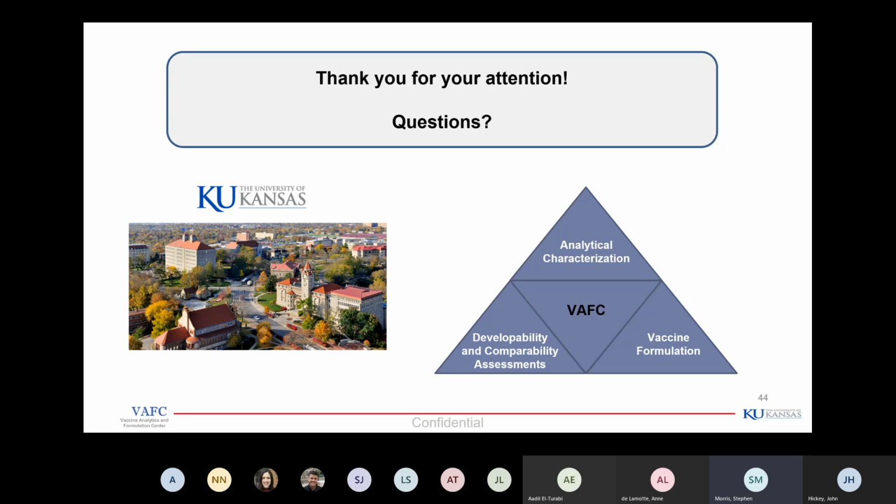John, if no one else has a question coming up, I just wanted to comment about the uses of, I see a lot lately about people talking about using mass spec for HCP characterization and level detection. It's not commonly the most used method at the moment, but there's a lot of attention towards it. I just wonder if you had any thoughts on where that's going and how feasible that really is.